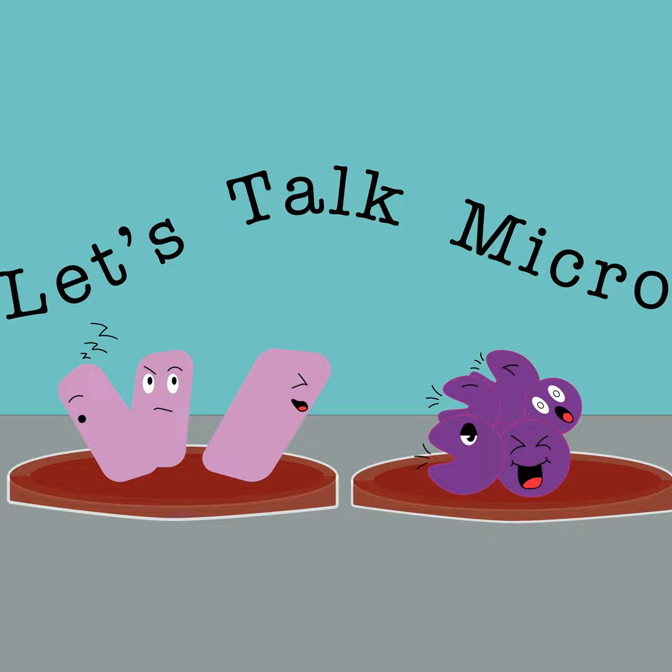Or they could even take soil if they didn't have access to that, because I didn't want them to go out and purchase something specifically for the lab. I didn't want them to have to pay any extra money or do anything that they couldn't get access to. So they would make a smear, and I taught them how to air dry it. Now, fixing was something we couldn't do. I told them to air dry it overnight, so you're really getting a good air drying. And then they just very gently stain with methylene blue.